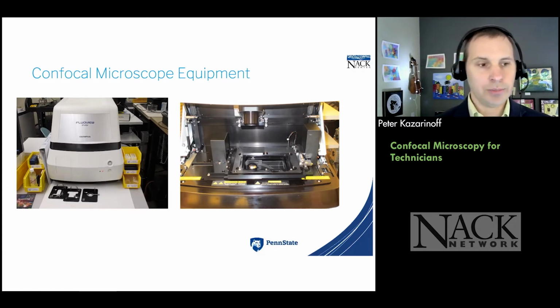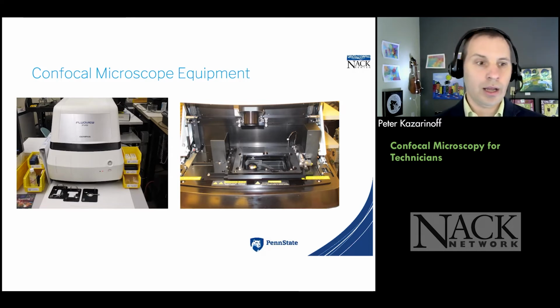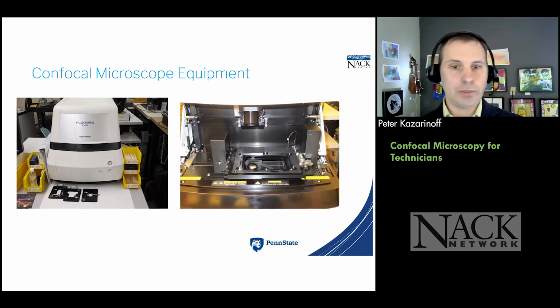These sample holders could hold different sample types, like sample dishes, sort of like little petri dishes with glass cover slips at the bottom, or microscope slides, or larger square sample boxes. And we instructed students on how to correctly mount and fix those samples.